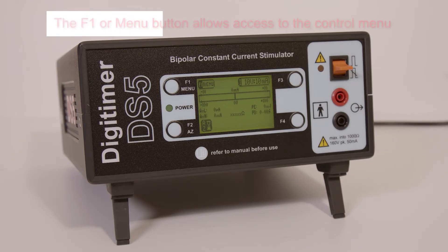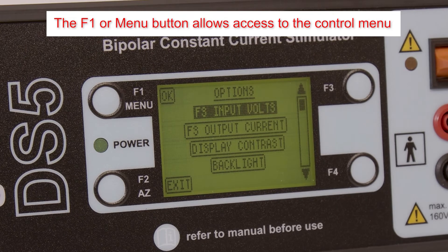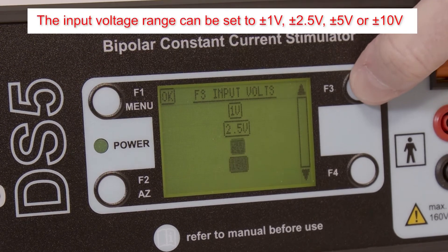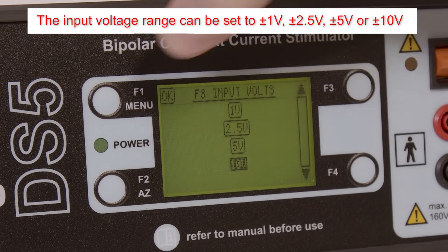The DS5 control menu is accessed by pressing the F1 or menu button and allows various settings to be adjusted. There are four options for the DS5 input voltage range, which should usually be set to the output voltage range of the device controlling the DS5.